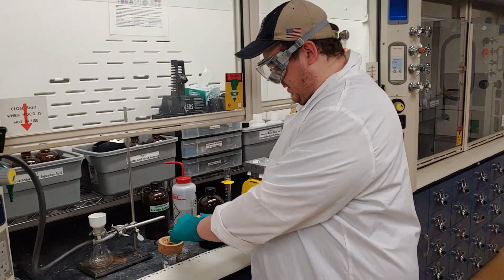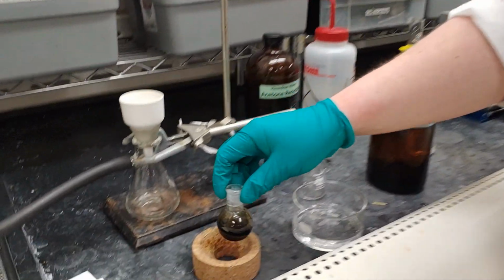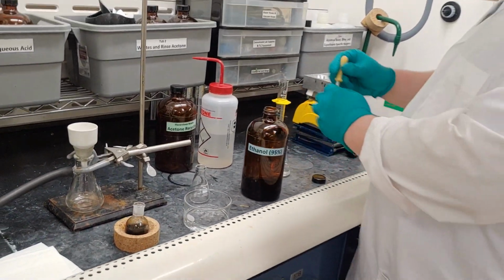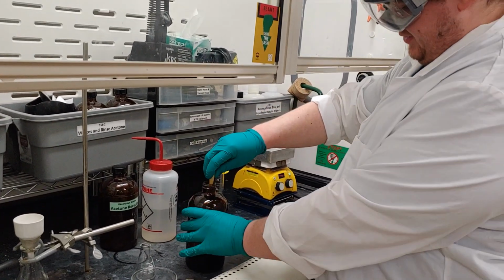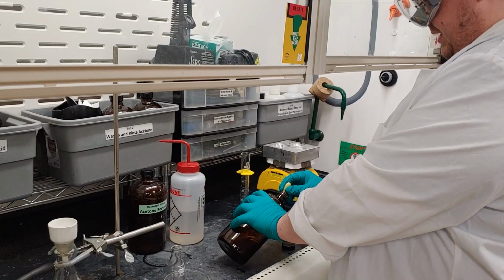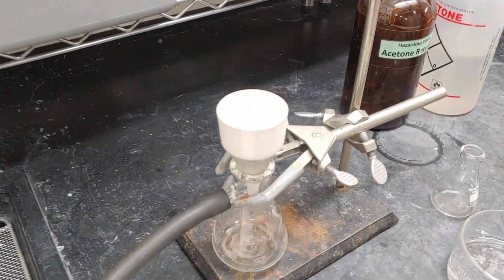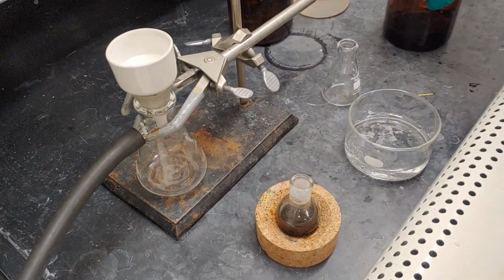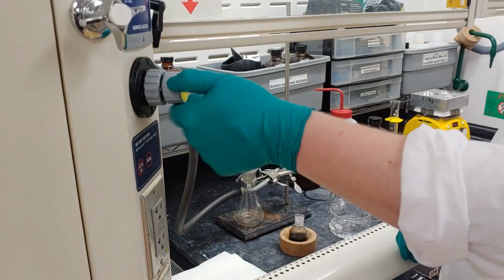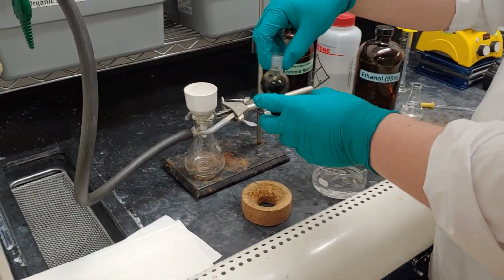Alright, so now that my reaction mixture has been cooled for about 10 minutes, I can filter it. So what I'll do first is wet the filter paper with a little bit of solvent. In this case it's ethanol. I will then turn on the vacuum pump and filter my solid.